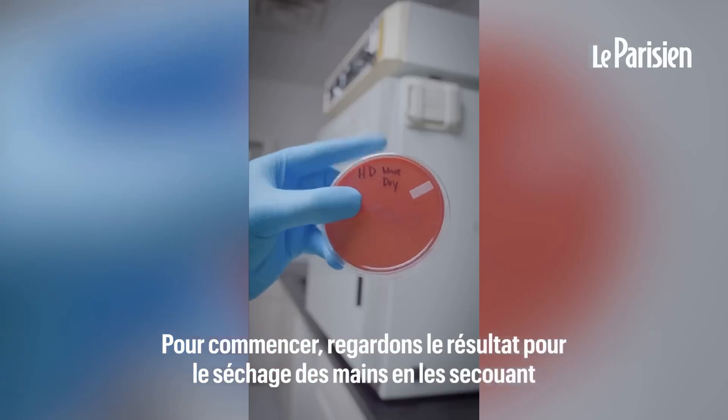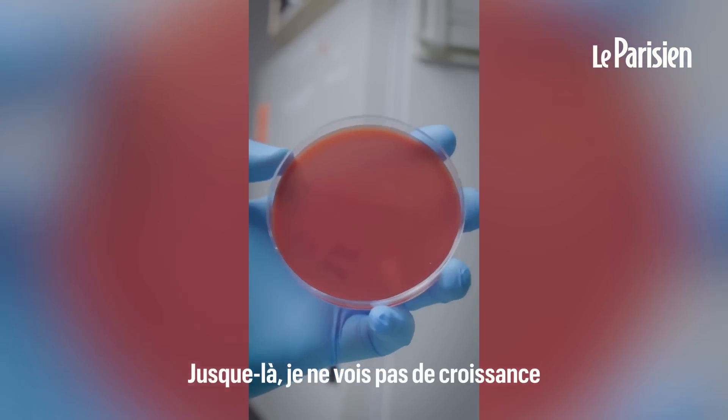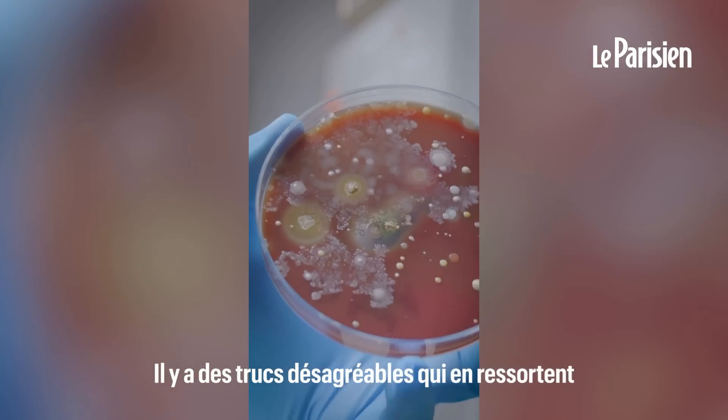First, let's see how the shaking or wave-dry method worked. As far as I can tell, there's no visible growth. And here's the hand dryer at that same location — there's still quite a bit of nasty stuff coming out of that.